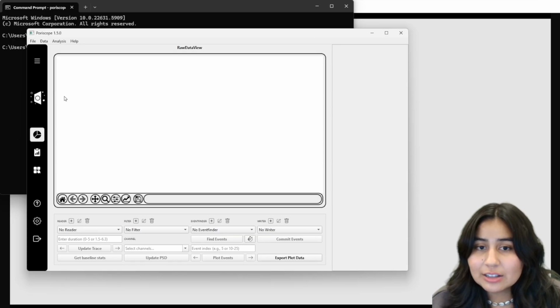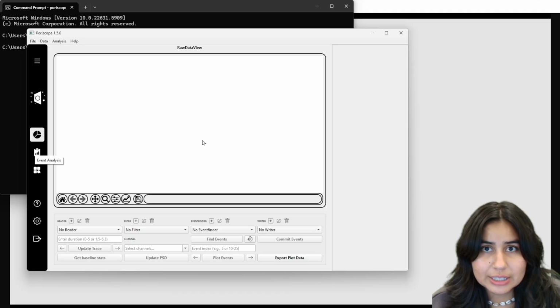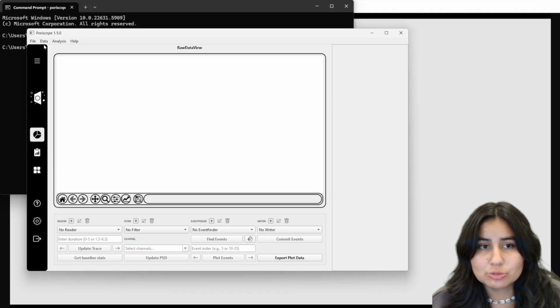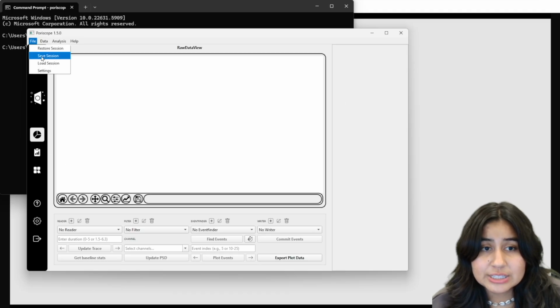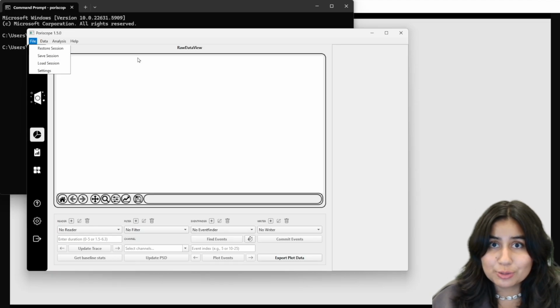It can fail. If you get distracted, you click something you were not supposed to click, then you lost all of your progress. So you should make sure to save your session progressively as you advance, as to make sure you don't lose your progress.